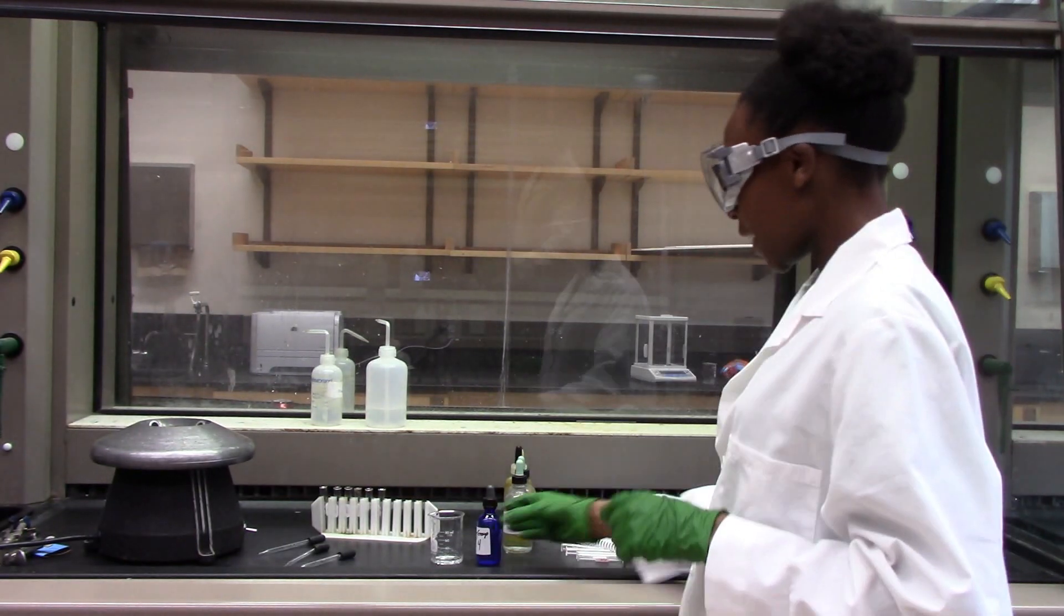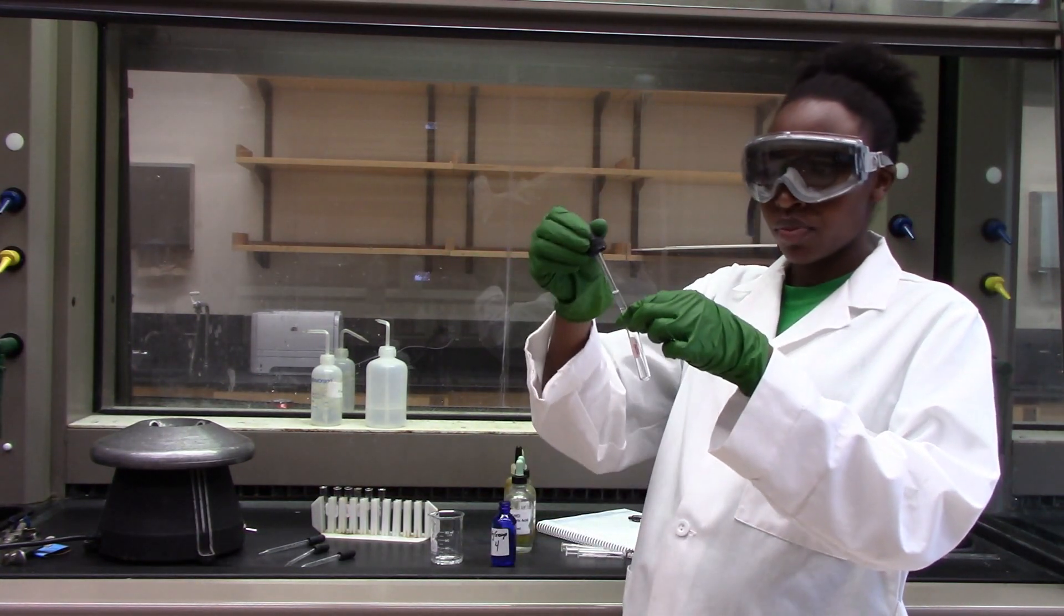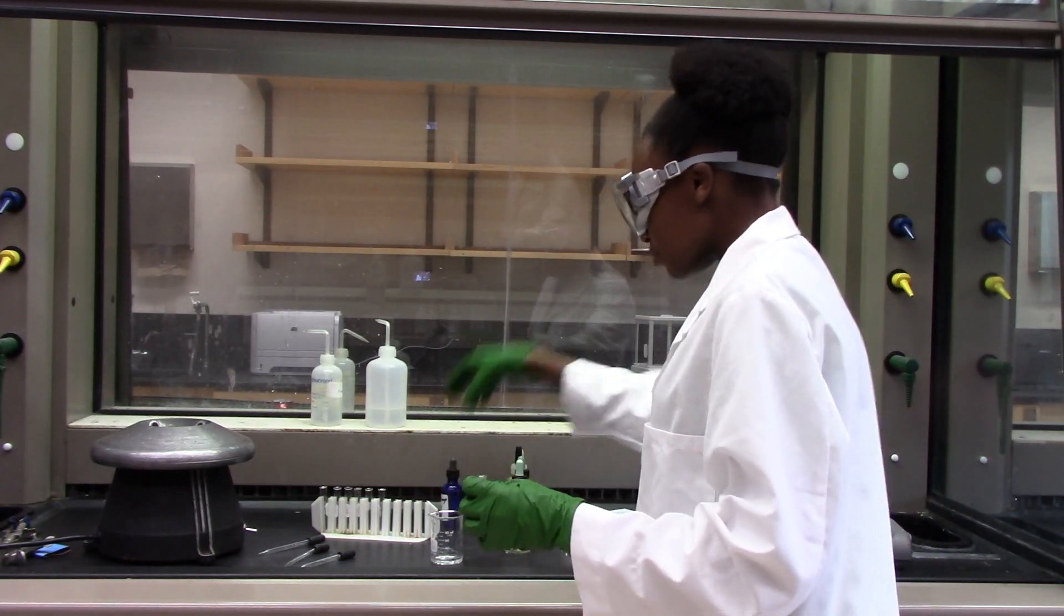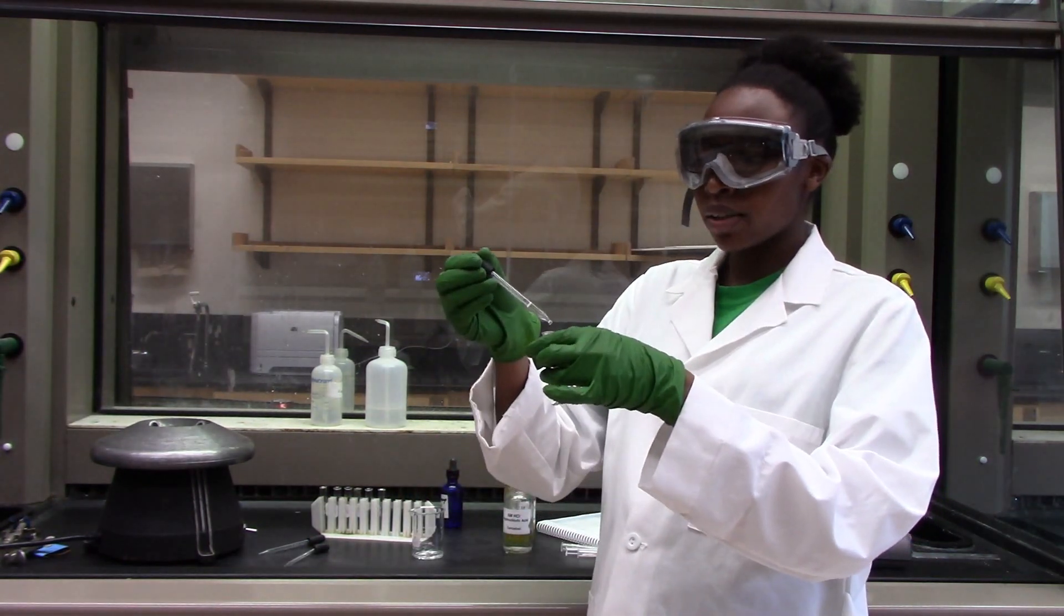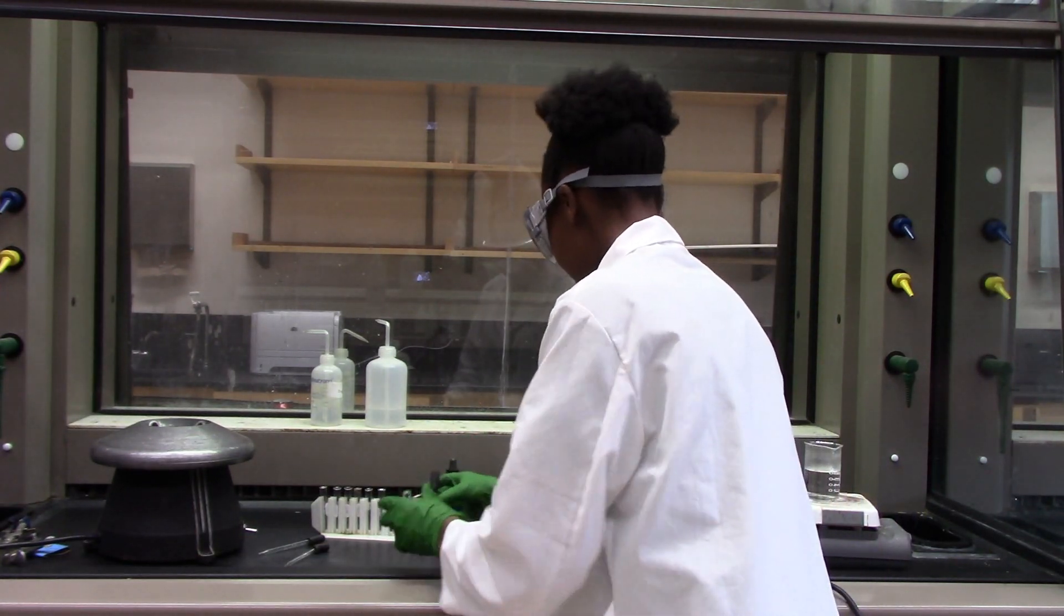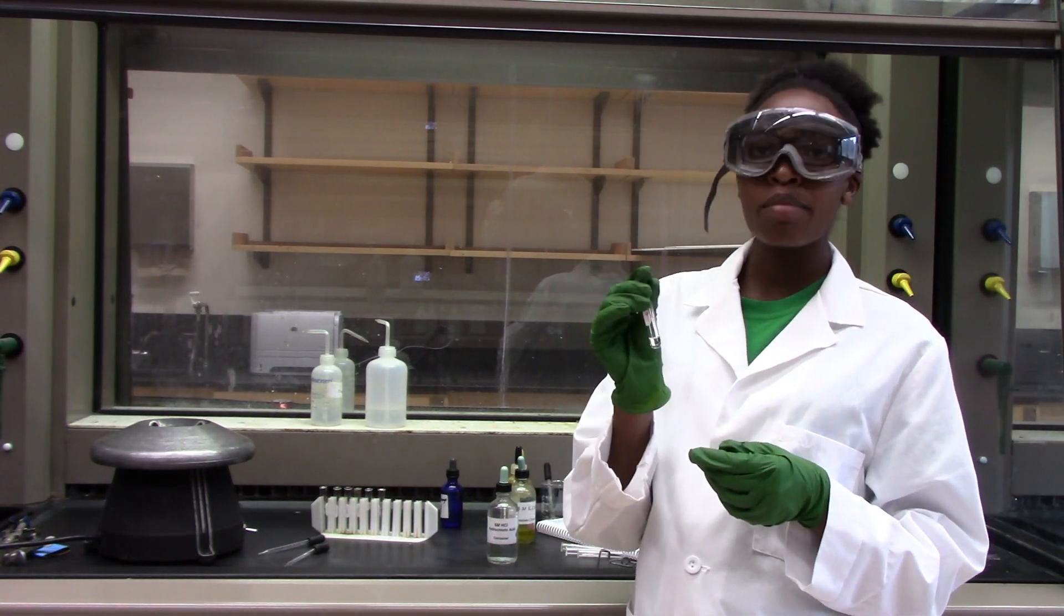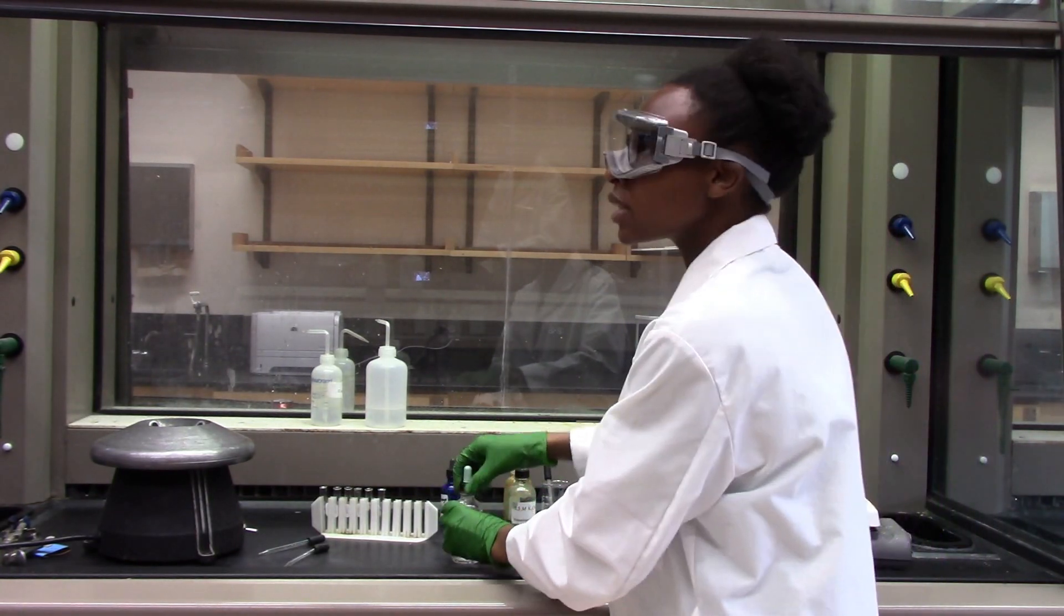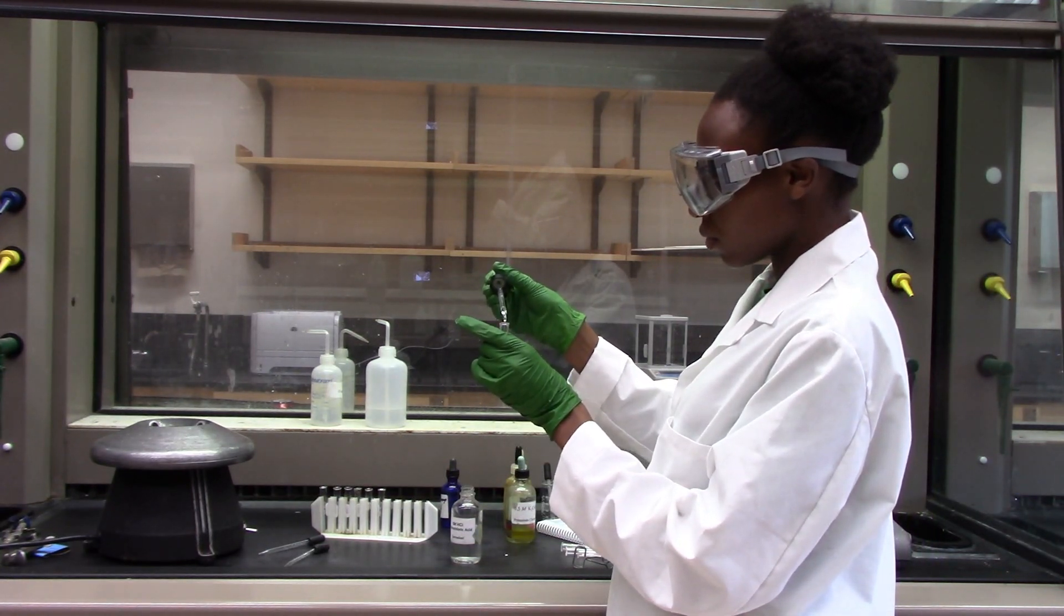We will get started by taking six drops of our unknown and putting it into the test tube. Once I have this, I am going to add about five drops of cold water, and this is the ionized water. Because silver group cations have insoluble chlorides, I am going to add six molar HCl. I am going to add two drops and mix it.